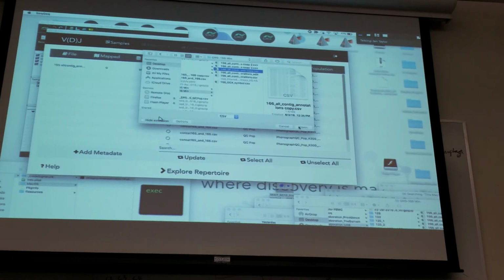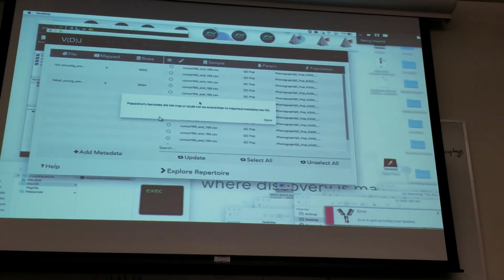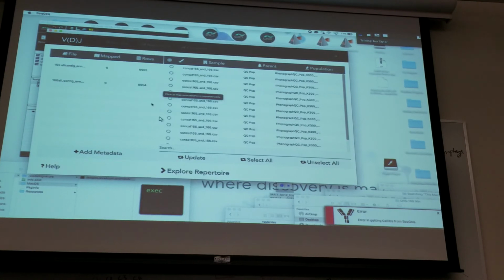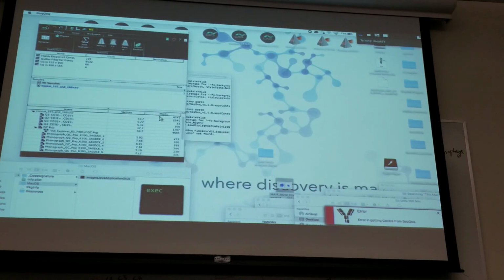Yeah, the cell IDs have to match. And we did send an Excel back, I think, an example where we got that to work. Which one is the concatenated? Okay, yeah, I was just having that problem. This problem. Yep. This is troubling. I wonder if I loaded the wrong annotations. That's the only thing I can think. What about the bottom? Yeah, I was just having that exact same problem.